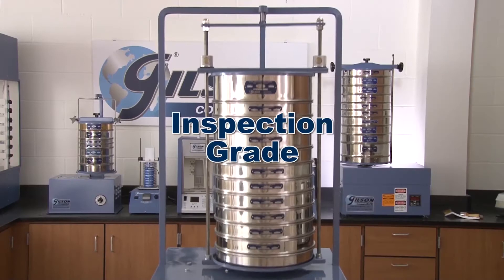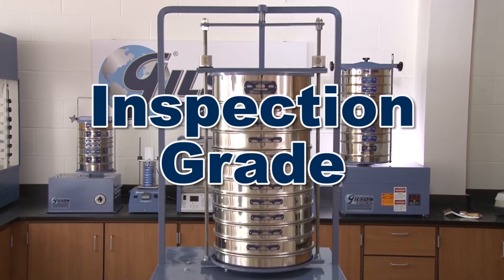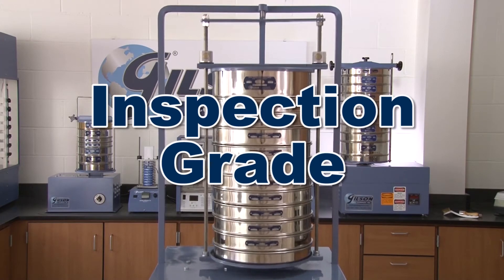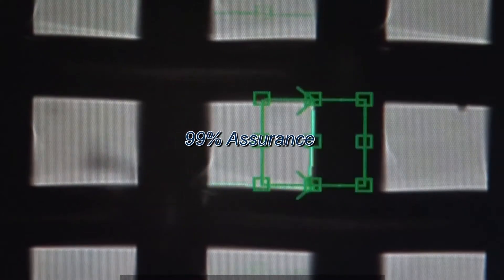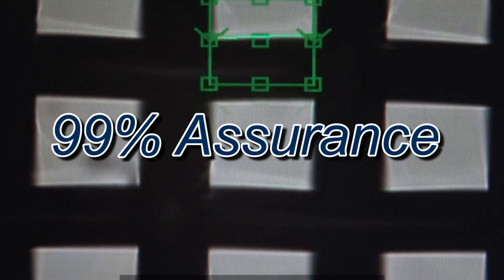Inspection grade sieves are a good choice in applications where accuracy and repeatability are critical. Inspection grade verification measures a specific number of openings to determine with a 99% assurance that your test sieve or screen tray meets ASTM or ISO standards.